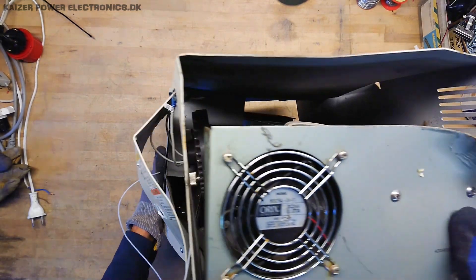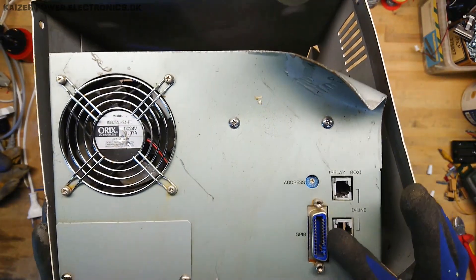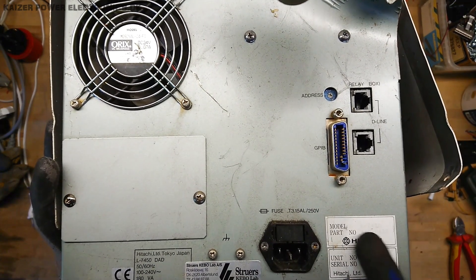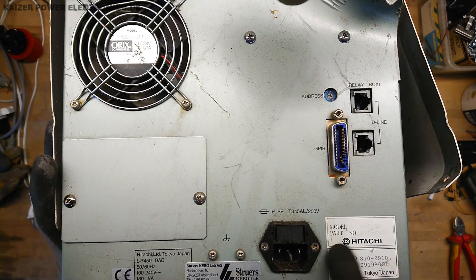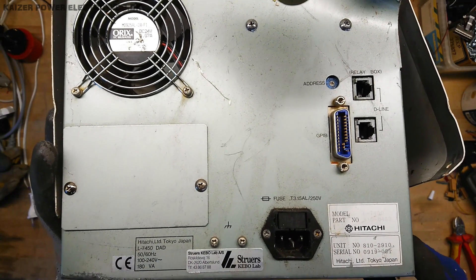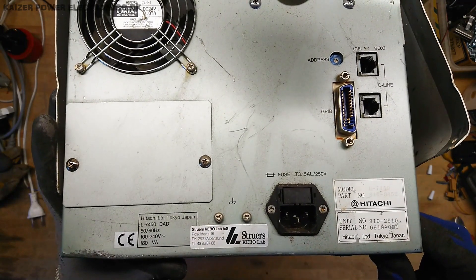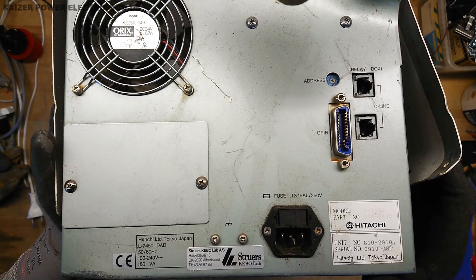On the backside we have a GPIB interface, as we would expect. The model number is confirmed as the L7450 by Hitachi. There are no real date marks, but we can see it consumes 180 VA — just below 200 watts — so I'm not expecting to find any high-power parts inside. Let's get the shielding off and see how damaged the unit really is.